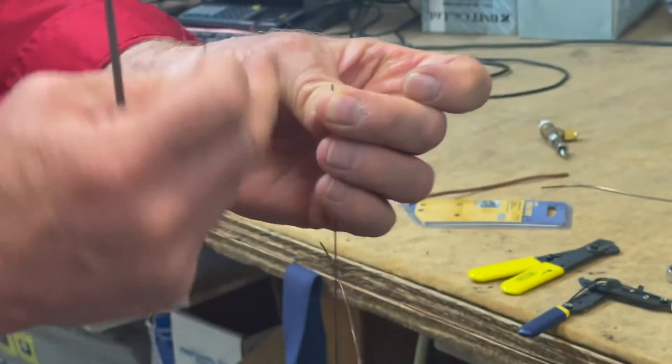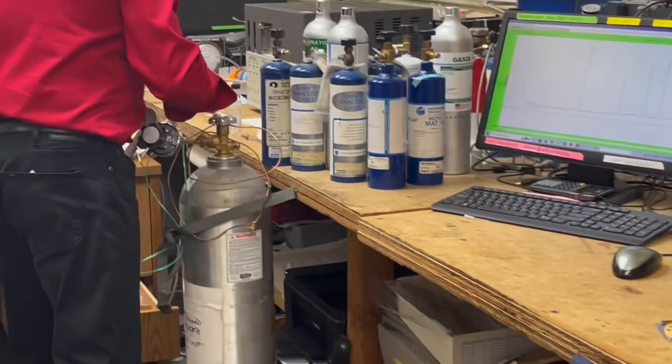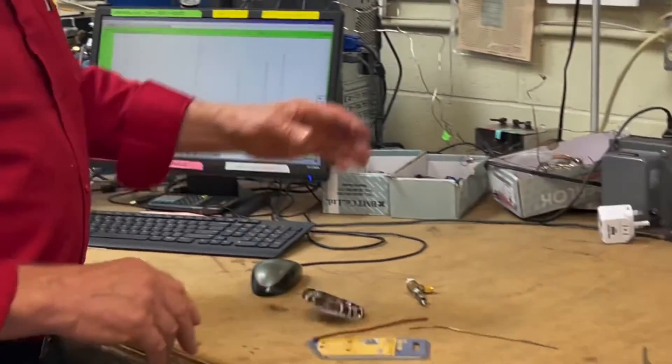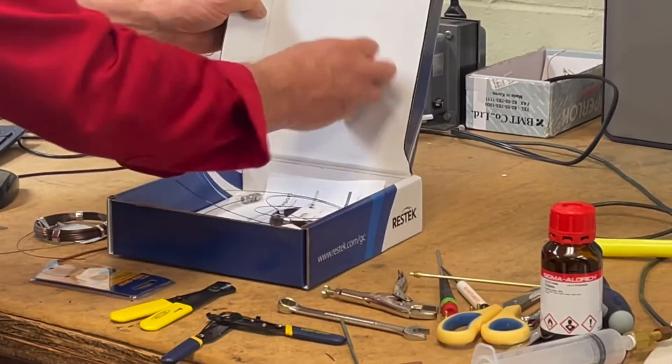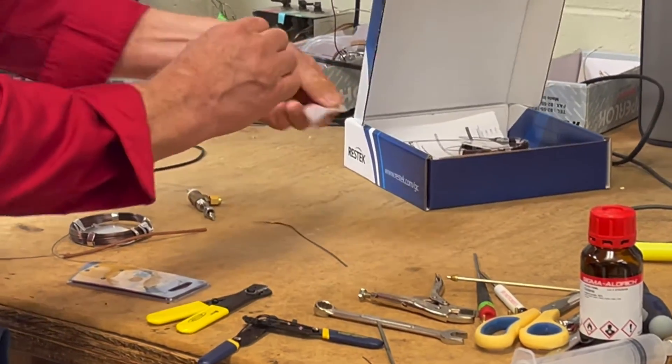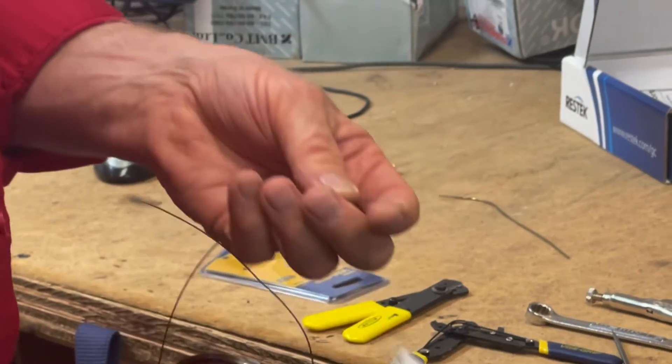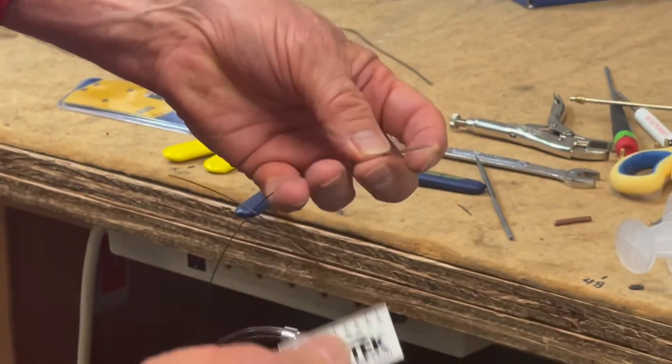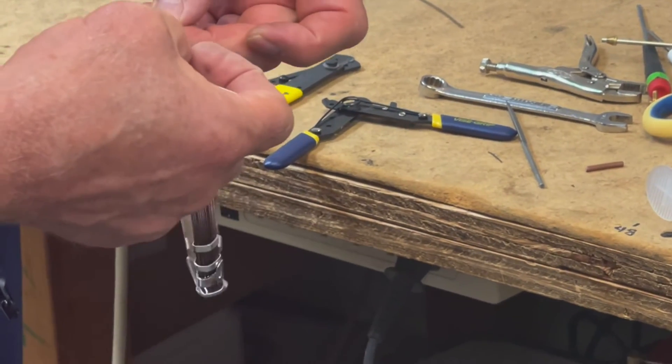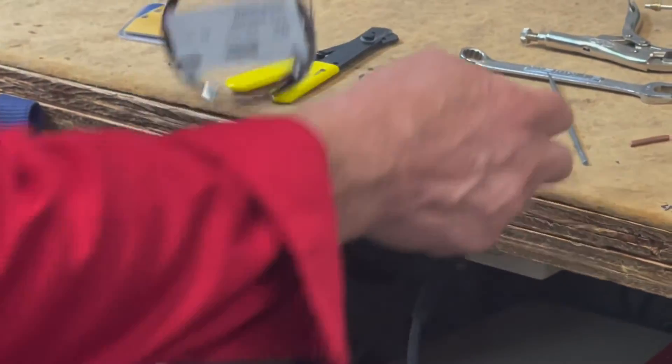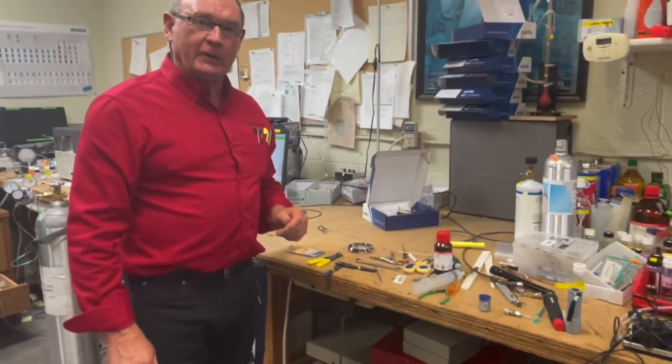Sometimes people use something called a scoring wafer. They oftentimes come free with the column if you buy it like from Restek, they'll give you a free scoring wafer with the column. The scoring wafer is just a very hard ceramic so you do the same thing, you position the column between your two fingers, you make a quick cut and then you snap it off right where the underside of the cut was. That's the story on cutting tubing for gas chromatographs.